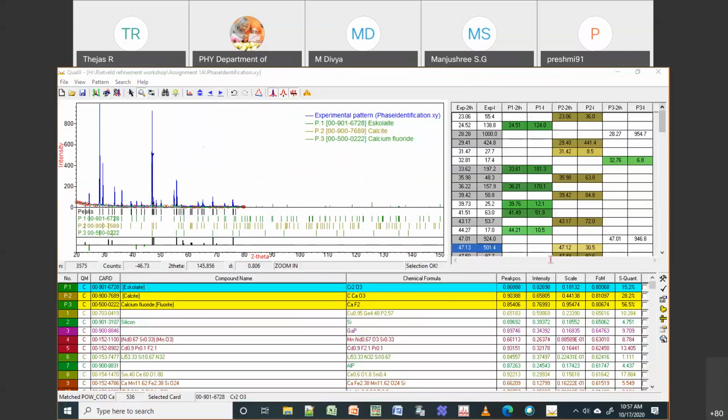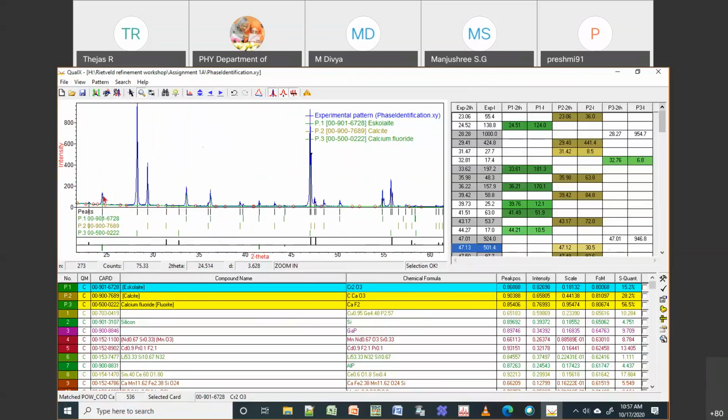After removing some peaks, can the data be used in the Rietveld refinement? All these software packages we are using, whether Fullprof or QualX, won't change your data file. They will not change the original data file. The data file will remain the same. Even if I remove this peak here, it doesn't change the data file. You cannot touch those data files. Only the calculated file will be generated. It will be a new file, not overwriting your data file. So you don't need to worry about playing with this, because you will not make any changes to your original data. The original data will remain as such.